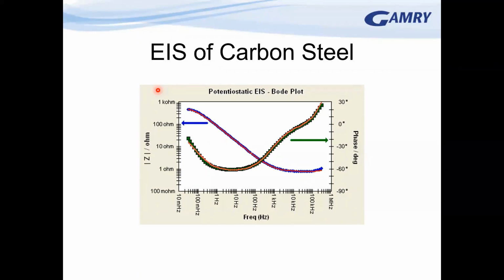And I will voice one little thing with it. The direction that the measurement moves tends to indicate whether or not you've got oxidation or reduction that is driving it. But in terms of whether or not it tells you anything about the system that is meaningful in terms of corrosion rates and how well it is getting protected from corrosion, the answer, I think, is no.